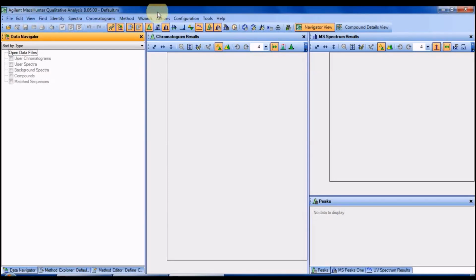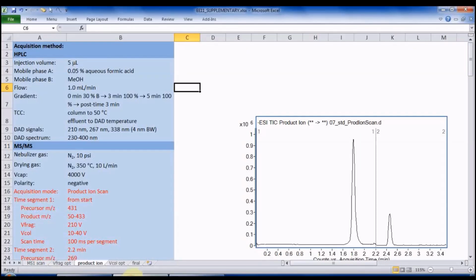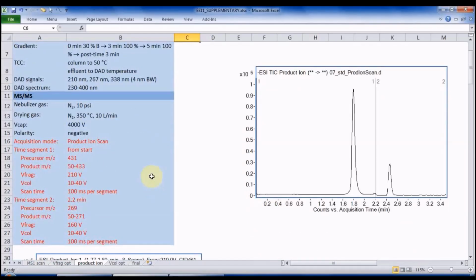The next important parameter is the product ion for SRM transition. The product ion should first provide high sensitivity, that is, it should be abundant. Second, it should provide high selectivity, so it should be as discriminating as possible. Thus, ions with high m/z and originating from less common fragmentation pathways are preferred. To select the product ion, we first need to record collision-induced dissociation spectra of the analytes. Since the fragmentation pattern depends qualitatively and quantitatively on collision energy, the spectra should be recorded at several collision energies.